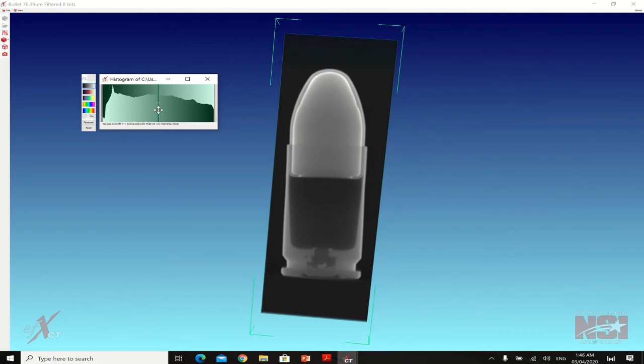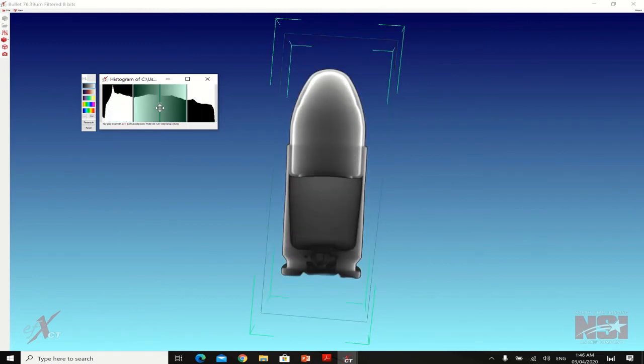As we go on, we'll be dealing with this much more and try to hang in there in controlling the histogram. Going back, put your cursor on top of the key, then left click, then scroll. This will narrow down the other keys.